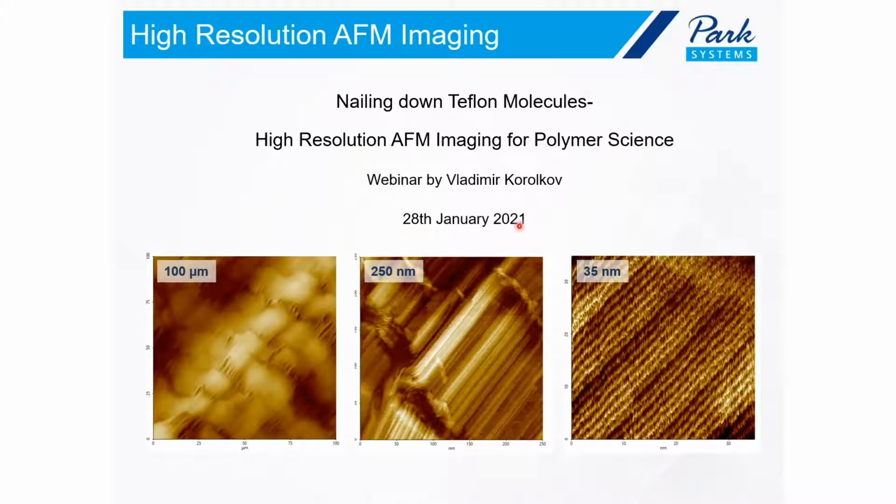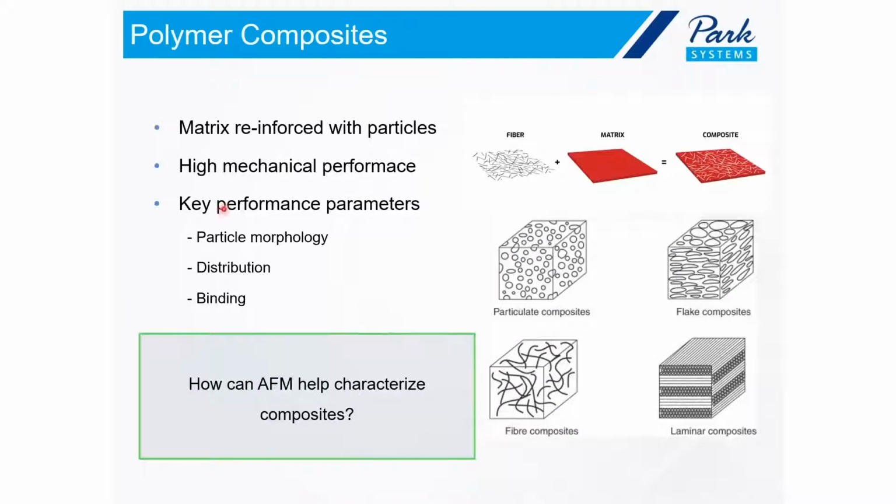He will give a repeat webinar on the 28th of January next year. So make sure you check that website and register. But I will not talk about molecular scale imaging. What I'm more interested to talk about is polymer composites.